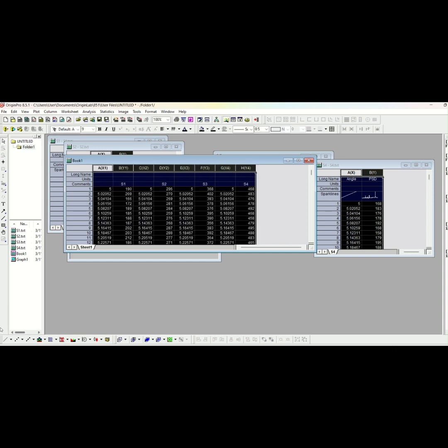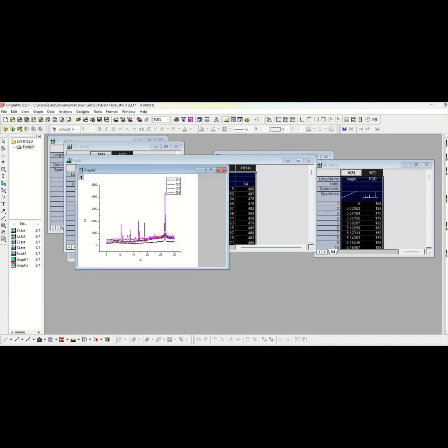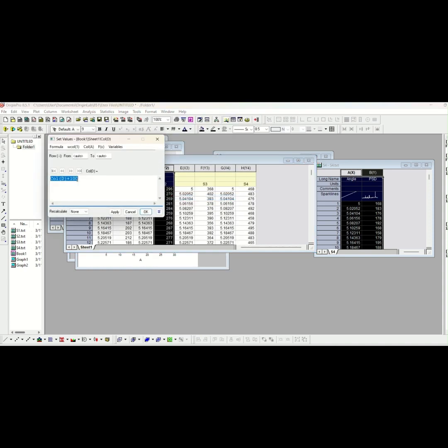Select all and click the line. Now the graph will look like this. Better but not completely better. So here we know that the Y value we added is not enough. We need to add more Y values. So again, right click and add more Y values. Now I am choosing a 500 difference.